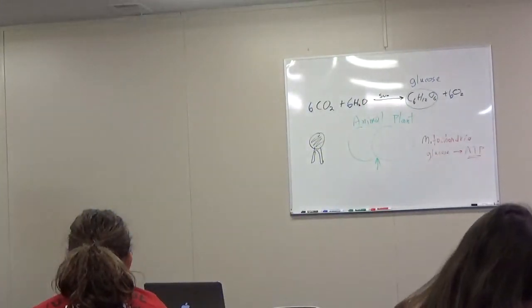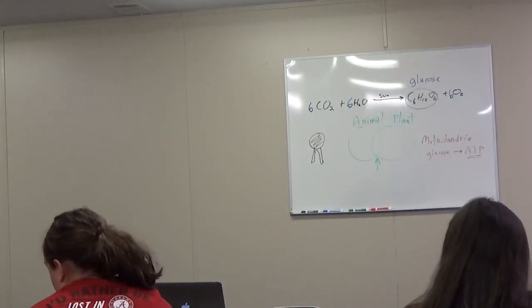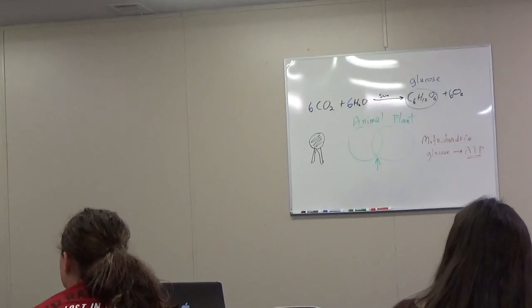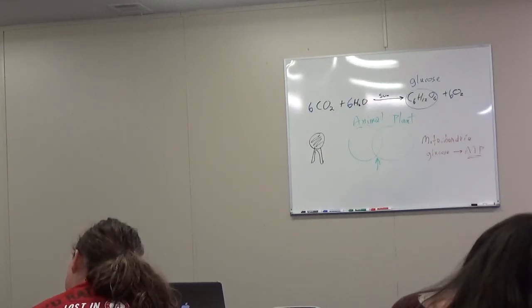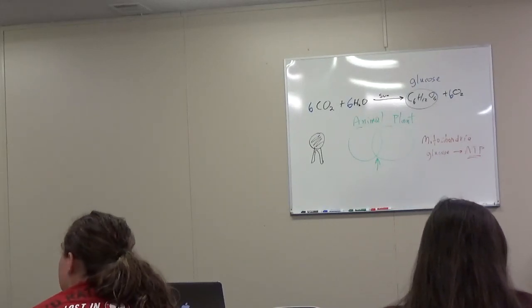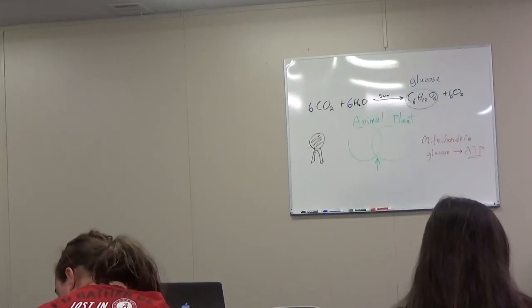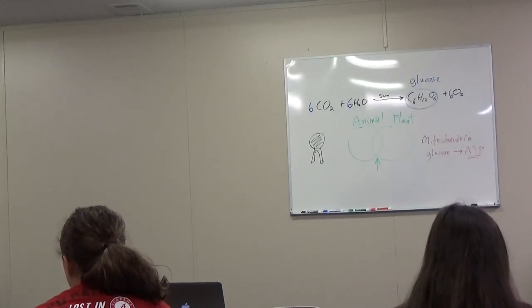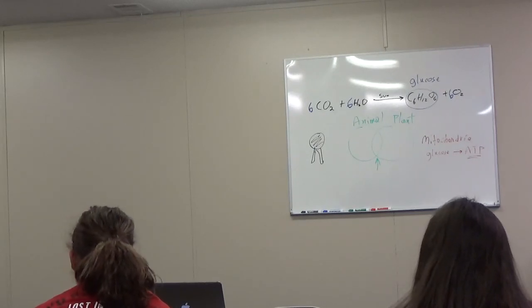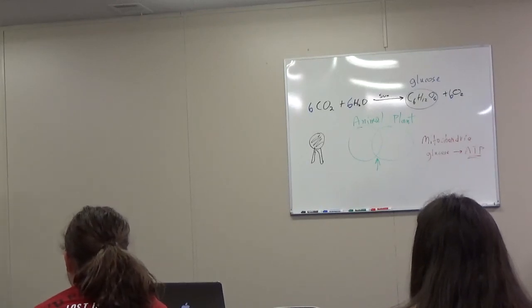In each one of your kits here, you have your slides, but you're also going to have something like this that says cotton swabs, dialysis tubing, rubber bands, toothpicks. The toothpicks are these plastic things. You can use those if you want, but I provided other toothpicks you can use. But the cotton swab should be there. For some of you, it's not wrapped up in a little container like that, but you can find the cotton swab down in the bottom of it somewhere. But you all have it. I checked them, every one of you has the cotton and the toothpicks.